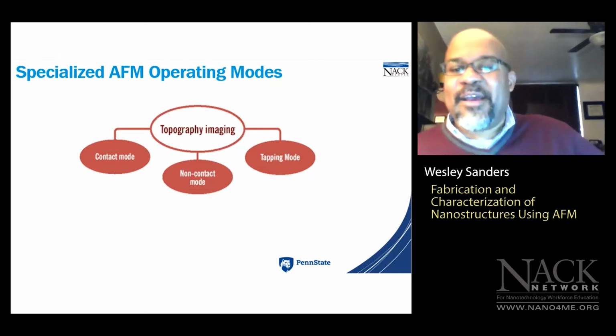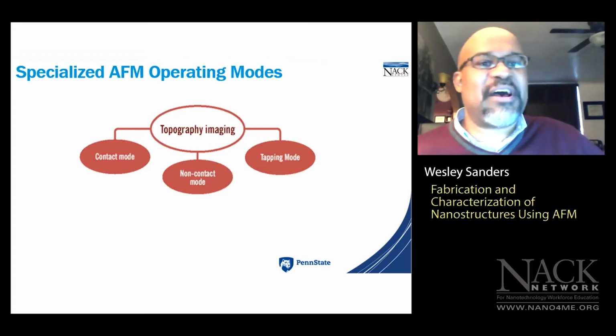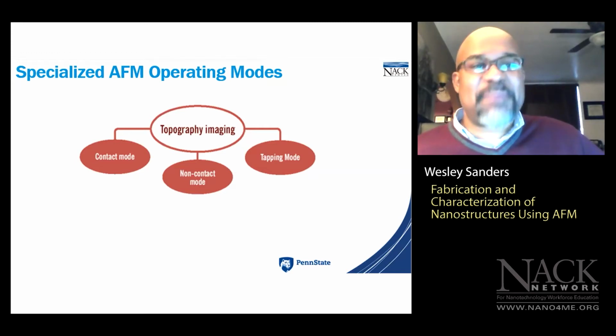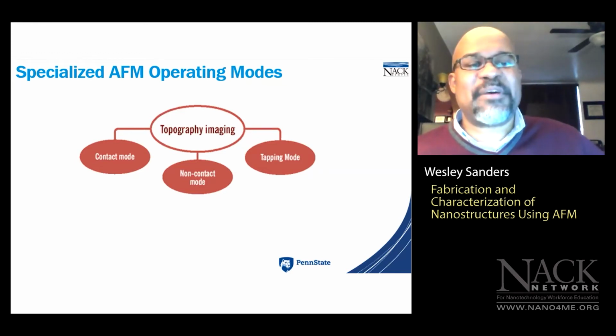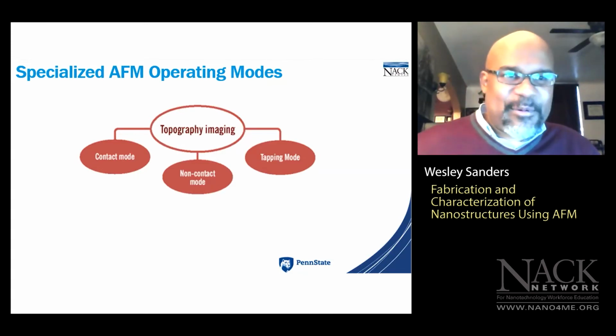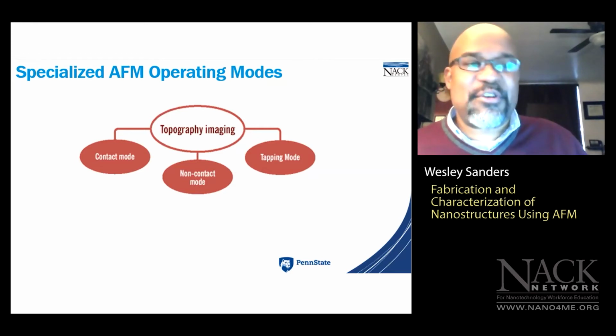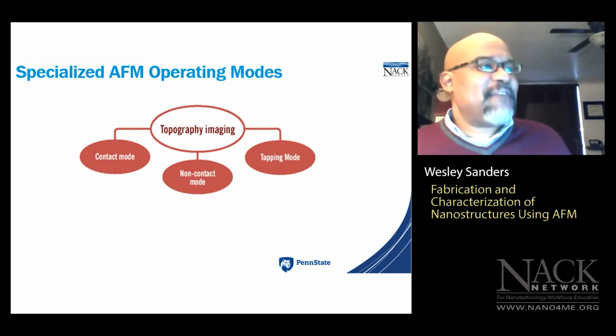No? Okay. All right. So I'm going to take about 30-ish minutes to talk about the specialized AFM operating modes, because I want to leave ample time for Glen's demo. We might end a little earlier than that. I might do 25 or so, again, to give Glen ample time to show you the technique and image the resulting structure.